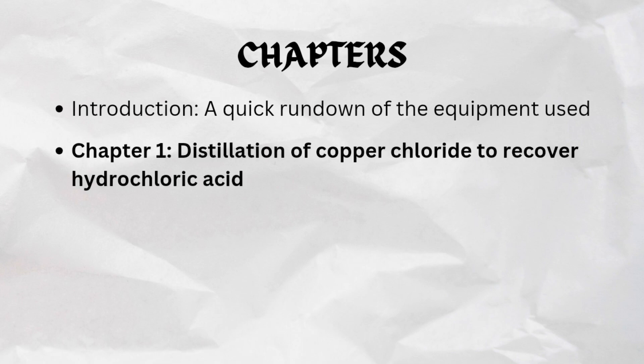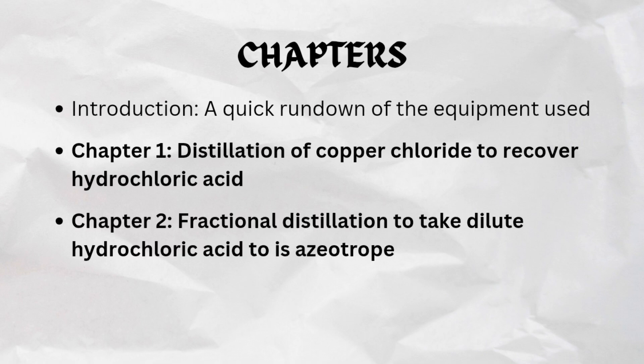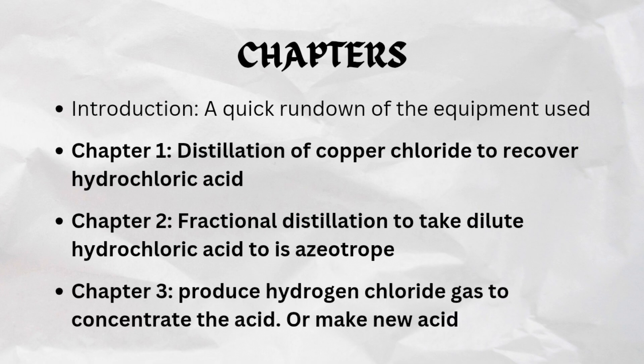Chapter 1 is on recovering hydrochloric acid from copper chloride using distillation. I'll also explain some of the challenges of doing so. Chapter 2 will be on fractional distillation of the recovered acid to bring it to 20%. And finally, chapter 3 — I'll show you how to generate hydrogen chloride gas to bubble through the recovered acid to take it beyond its azeotrope. You can also use this method to make fresh hydrochloric acid.